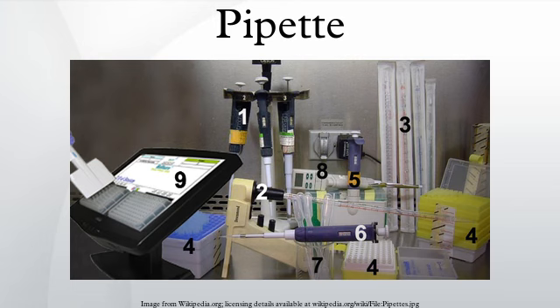Historically, the accuracy of a graduated pipette was not as good as that of a volumetric pipette. However, with improved manufacturing methods, the accuracies listed by the manufacturer can equal volumetric pipettes. Graduated pipettes have plus/minus tolerances that range from 0.6% to 0.4% of the nominal volume when measured at 20 degrees Celsius. Graduated pipettes are manufactured according to ISO specifications for accuracy and the arrangement of the graduations. A-grade pipettes are more accurate than B-grade pipettes.